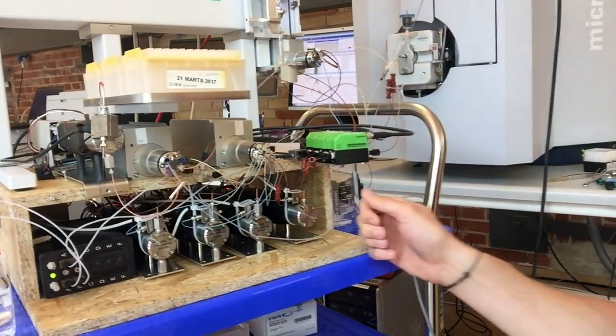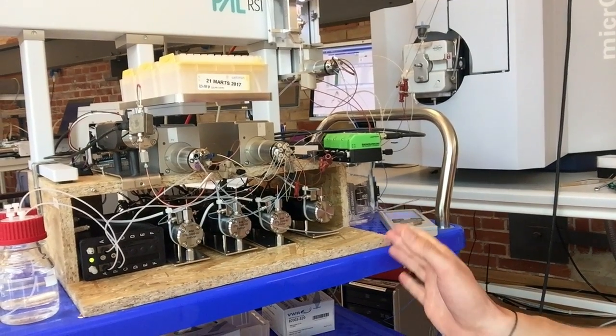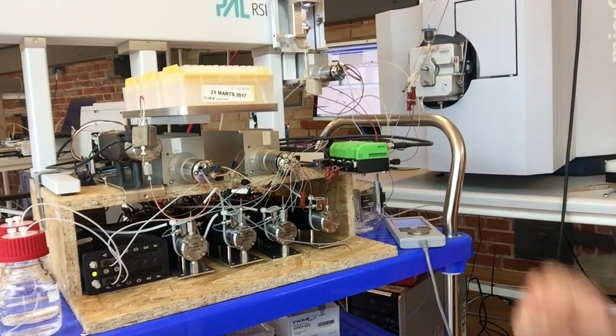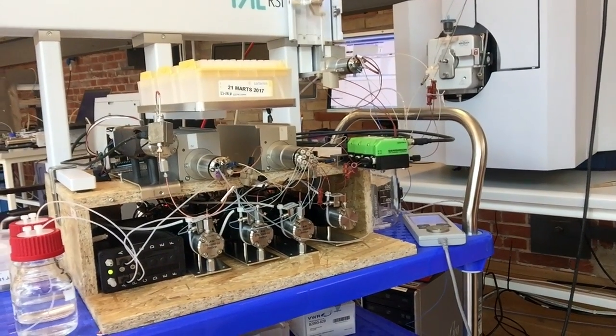The idea is that we want each pump to be in a pump module. So if anything happens to a channel, we can basically just pull out the entire pump module and exchange it with a new one, and then we are good to go again.